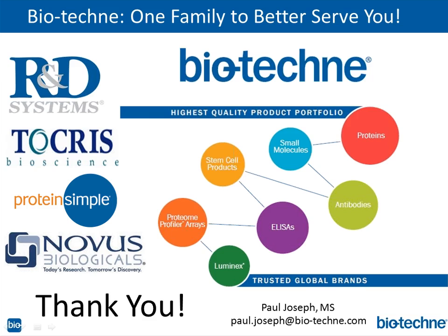There was something else I wanted to mention too about non-fat dry milk. I think years ago I was dealing with an issue where someone was using a commercial non-fat dry milk versus, say, like Carnation. We always see the Carnation box on the shelf in a lab, and I think folks were getting better results with phosphorylation and detection using just the crude stuff, believe it or not.